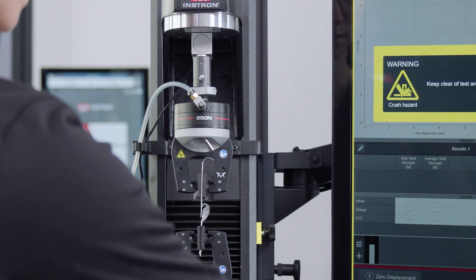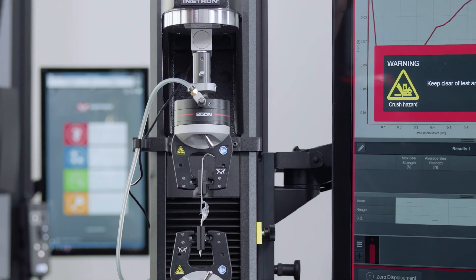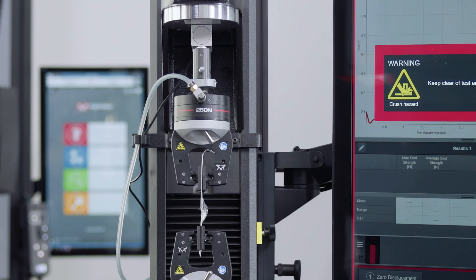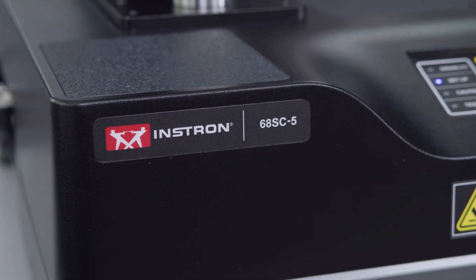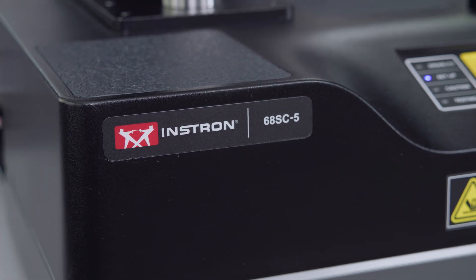In this example, we will be testing medical consumables on a 6800 single column system.